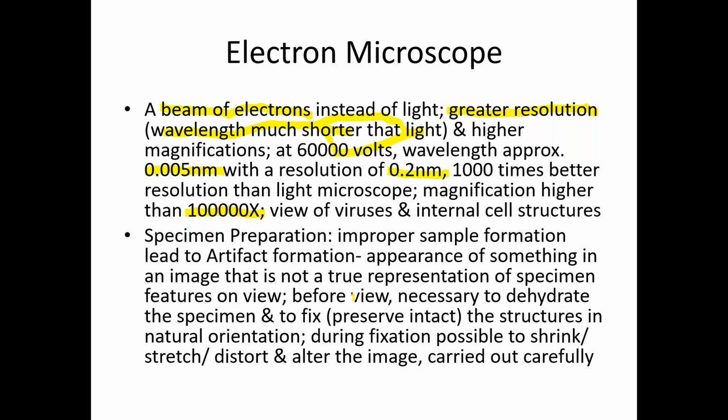Fine. Now, the most important thing we have to learn in electron microscopy is specimen preparation. It is also mentioned in your syllabus, regarding specimen preparation and staining used in the electron microscope. We have to learn a bit about that. In light microscopy, you will be learning it in another portion regarding staining, simple staining, gram staining, all those things. I am not sure about that.